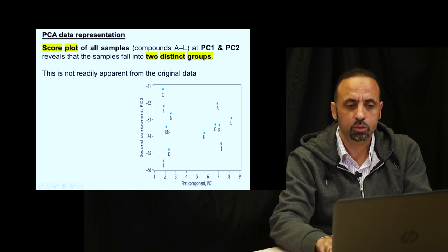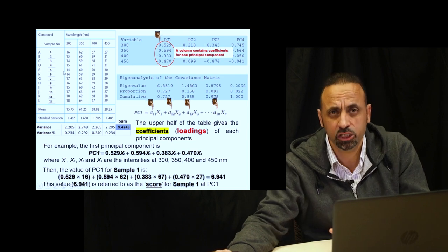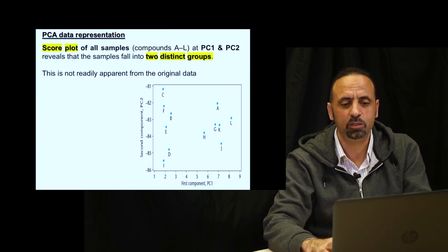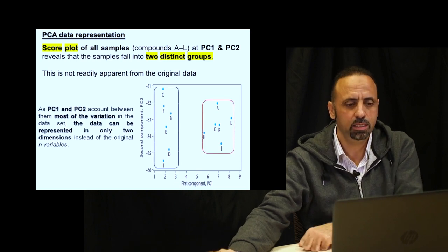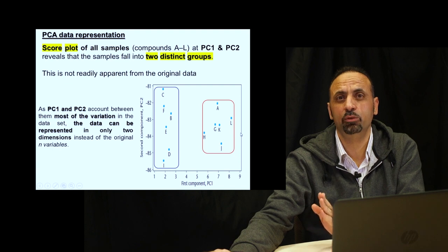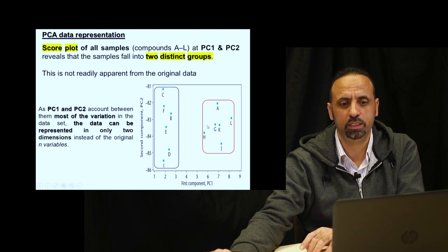Of course, using the previous information, we cannot make this kind of categorization or discrimination between the samples because it is not clear. That's why these principal components are called hidden variables or latent variables, because they give us information about something that could be hidden, that you are not able to see by eye. So PC1 and PC2, because they captured most of the variation and make a projection of the data, can make this kind of discrimination, a distinct limit and threshold between 2 groups of data.